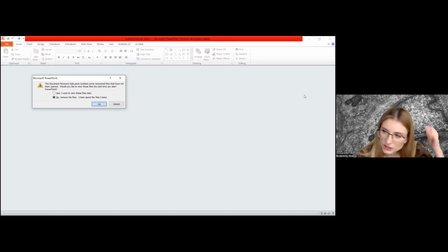My PhD thesis was about intercellular junctions of the heart, and I used 80,000 magnification for the gap junction analysis, but we really rarely use such high magnification. For biological samples, as I mentioned, we use 3,000, 5,000, 10,000 magnification.